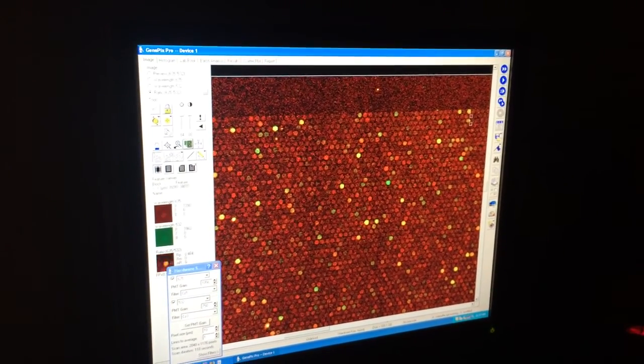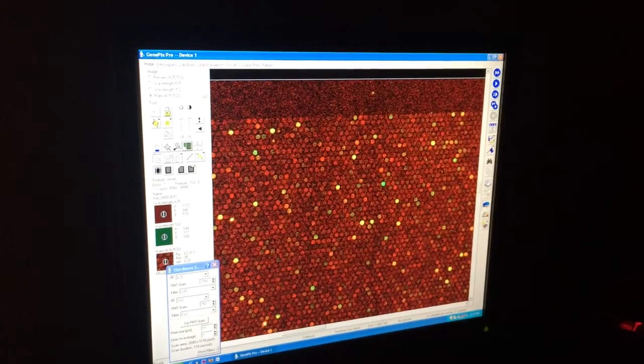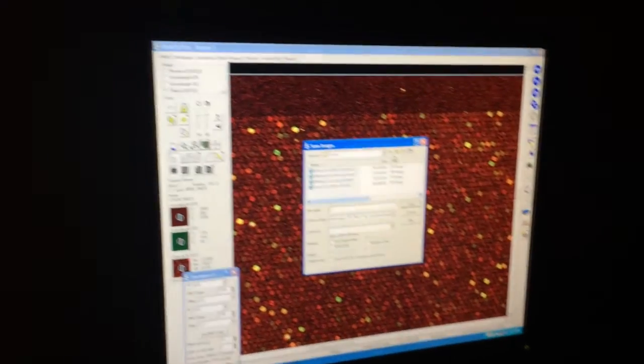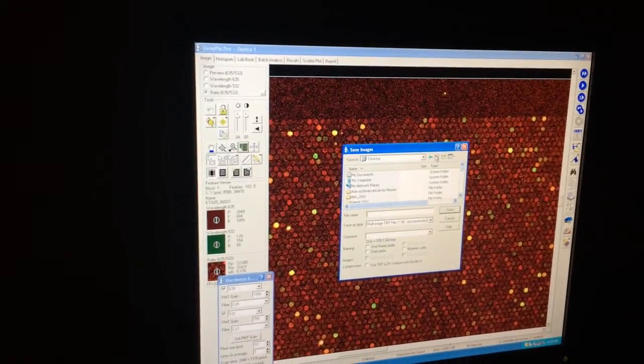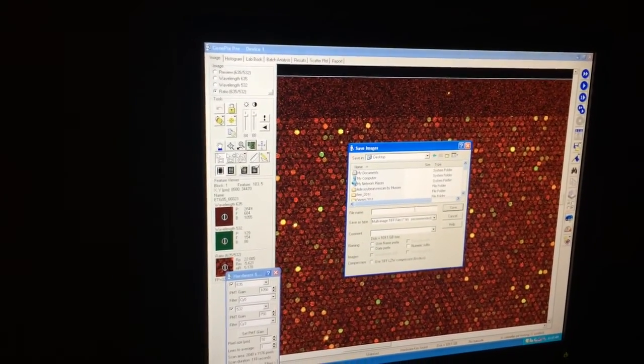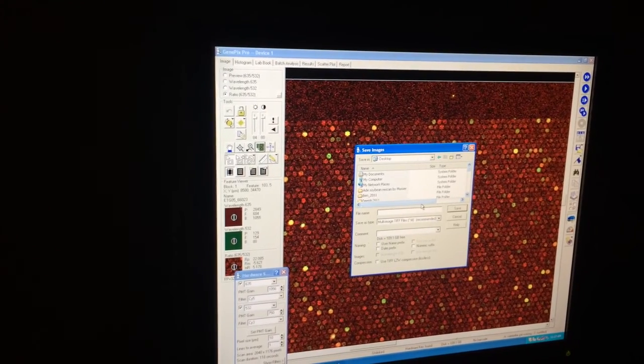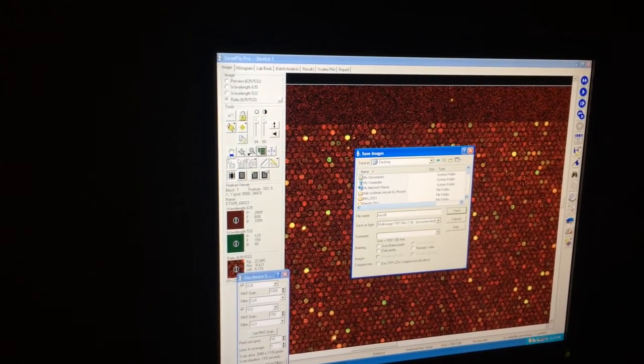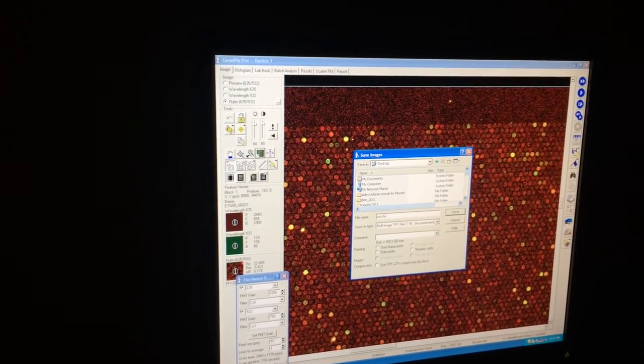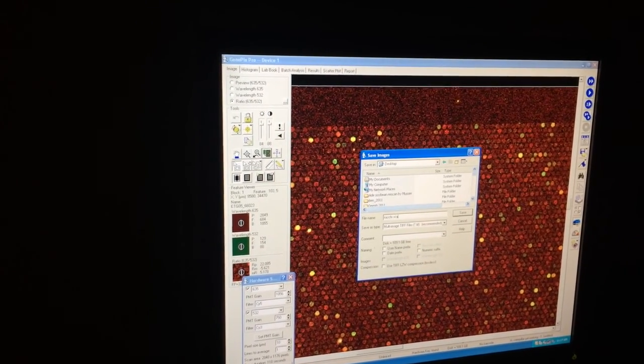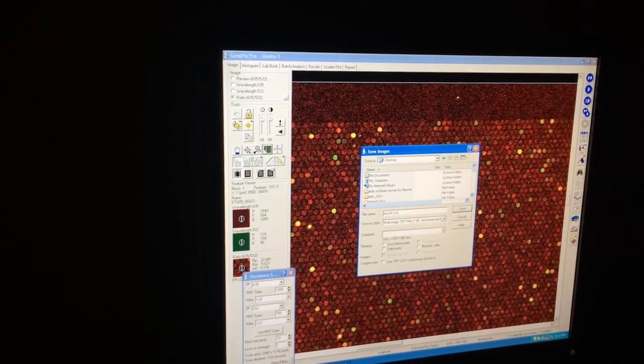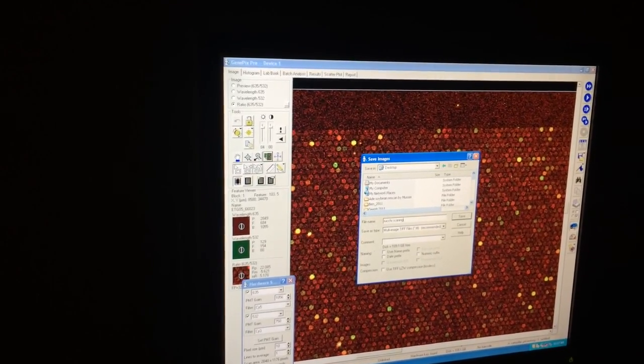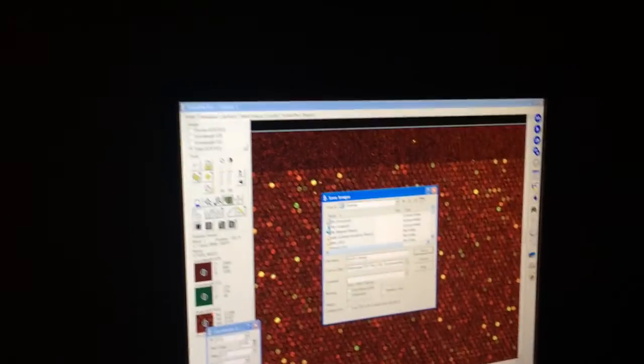All right. So I'm going to save the image. I'm going to call it Rucci's Practice. And that concludes the scanning video. Thank you. Bye.